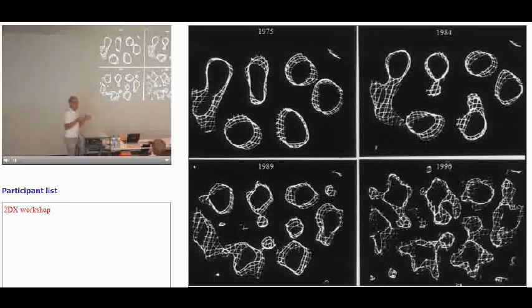So that's why now, if we talk about having another factor of 2 here and 2 there, another factor of 5 will make an equally big difference, actually, and particularly the high-resolution single particle. We need to go for these apparently small factors. But anyway, so that was the 1, 2, 3, 4, 5, 6, and these were almost unresolved. But there were 7 transmembrane helices.